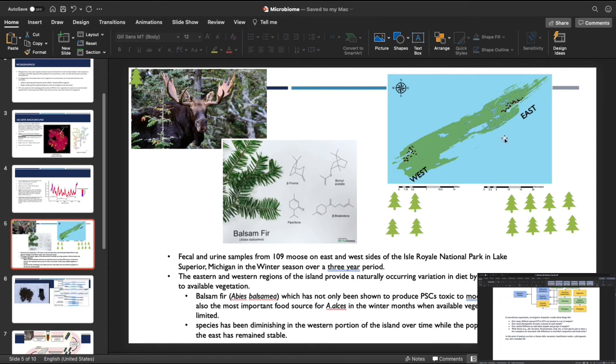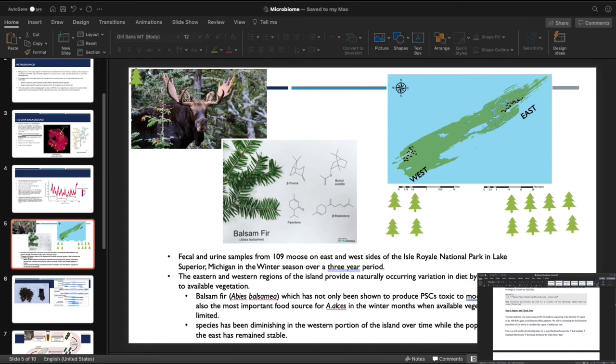So at this point in the analysis, we're going to skip ahead a little bit, past importing and checking data, and step ahead to step 4 super quick so I can make sure that you've downloaded all the data. So first you're going to need to download the data.